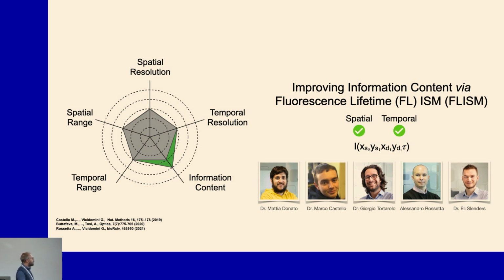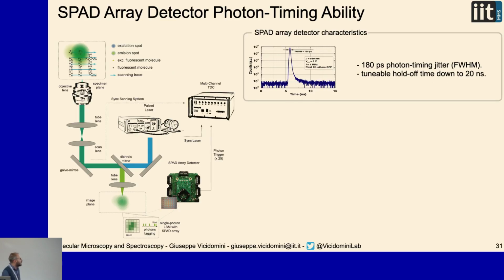As I told you before, I was just discarding the temporal information, but that's information that I have and I want to use it. In this context, I will show you an application in which I'm using the temporal information to measure the photon arrival time with respect to a pulsed laser, which is the information that you need to measure what is called the fluorescence lifetime of your molecule, thereby adding functional information to your measurement, because by the fluorescence lifetime measurement, you can understand, for example, the microenvironment of your probe, and some interactions of your probe.